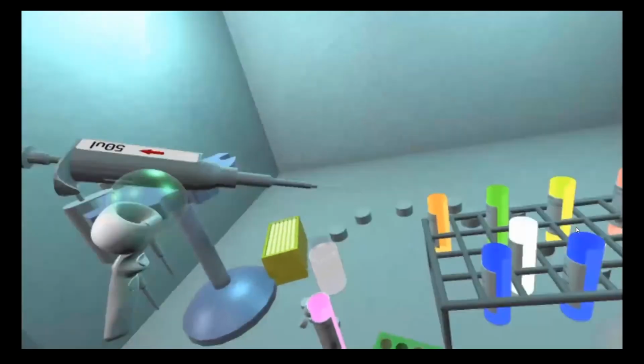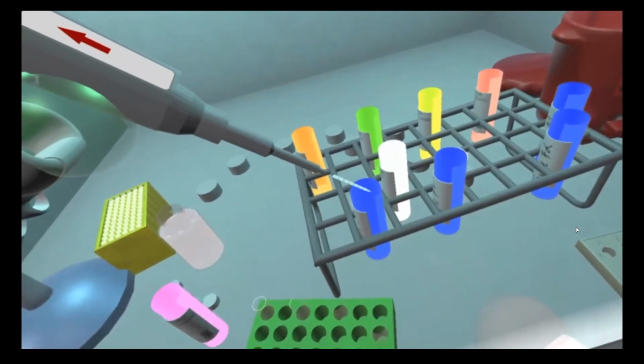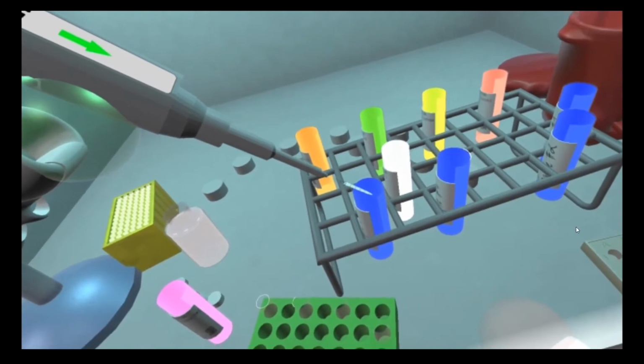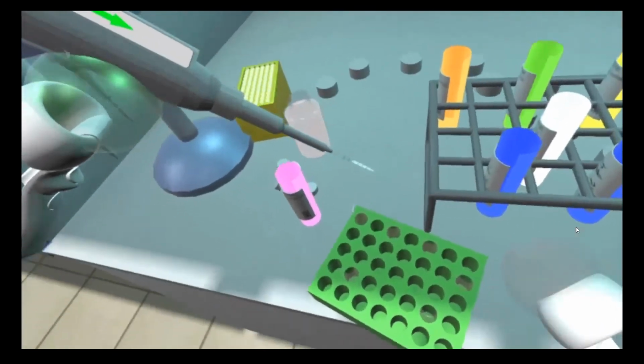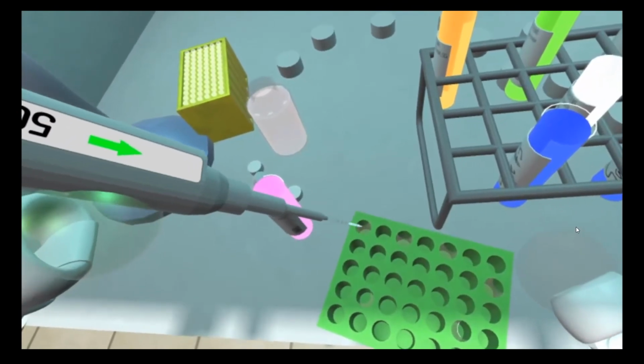Exacting and careful measurements of each reactant is essential to achieve an accurate result. Using lab equipment like a thermal cycler, a centrifuge, and a PCR machine, students will enhance each sample as they go through this accurate-to-life process.